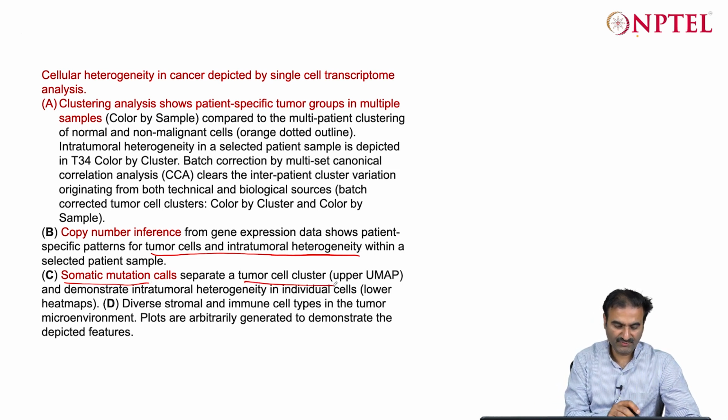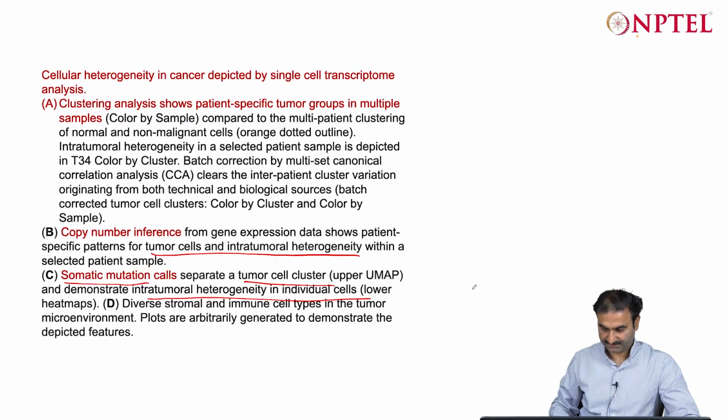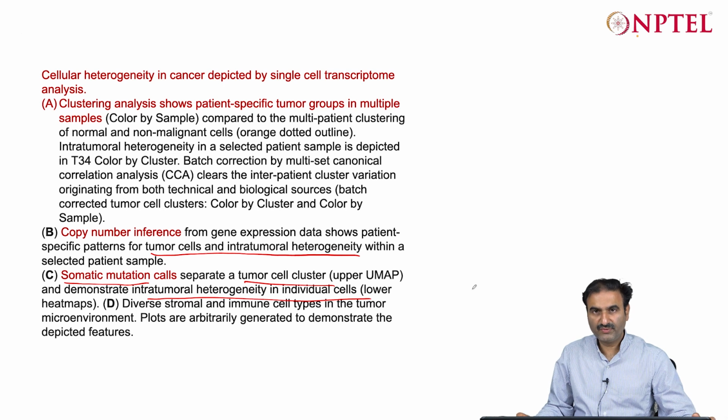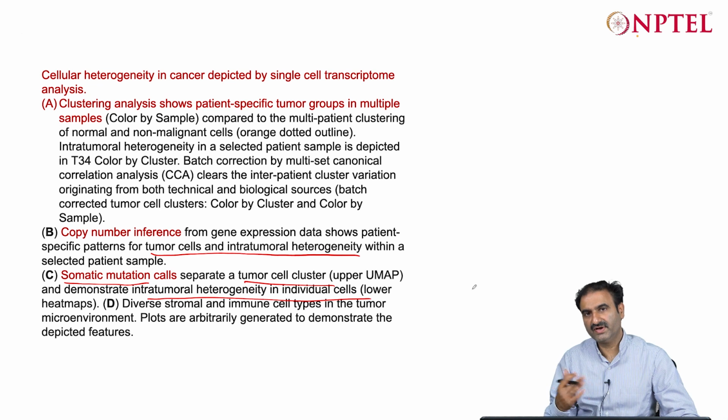You can map and demonstrate the intratumoral heterogeneity in individual cells, in the lower heat maps that we see in this picture. This can help us perform complex analysis of the heterogeneity in gene expression in cancer versus healthy cells.